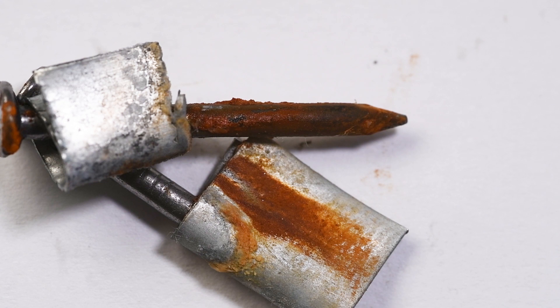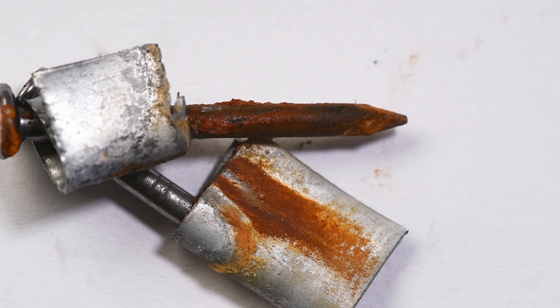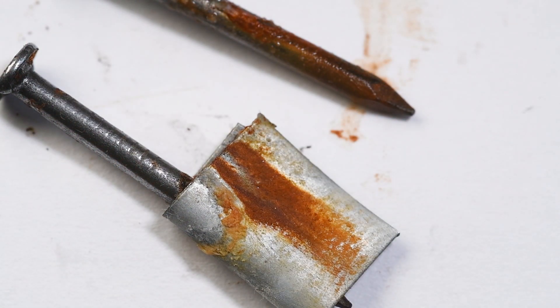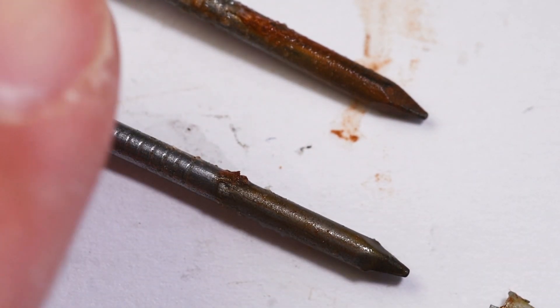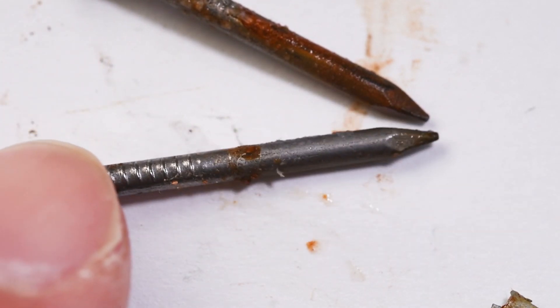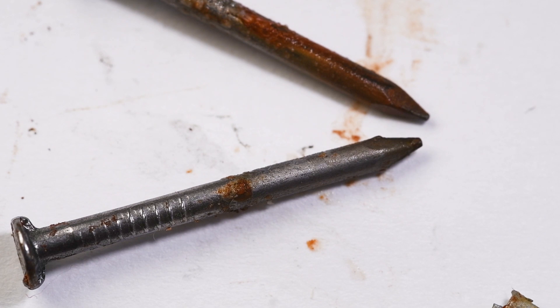Finally, another sacrificial protection method using zinc to surround the iron. On first inspection it seems this hasn't worked very well because the nail at the top has become really quite rusty. What I think happened is that the zinc was actually out of the water, so that top nail had oxygen and water touching the iron but the zinc wasn't immersed. If I remove that zinc you can see quite a bit of rust on the top nail; however the bottom nail is still really quite clean with not much evidence of rust.